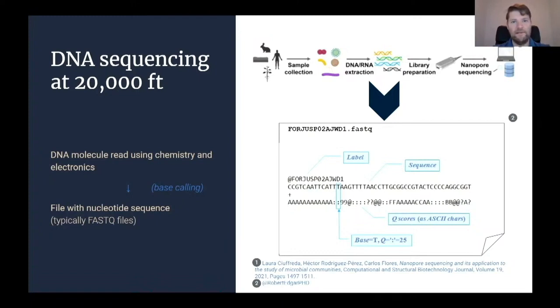Then there is the DNA sequence that has been base called. So this is the sequence that we believe came from the fragment that we sequenced. Each record here is for a given fragment, I should say, just to be upfront about that. So then we get the sequence for the fragment. There's a separator, a plus, that's fixed from the format.